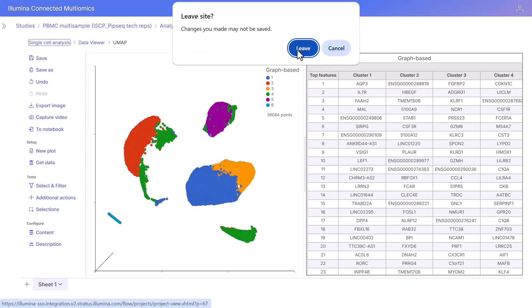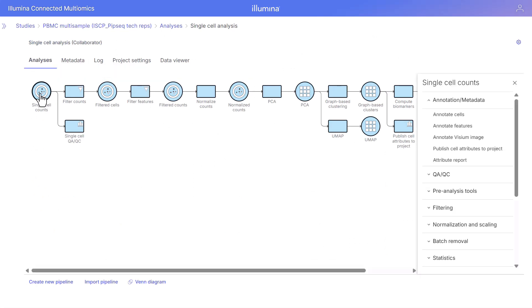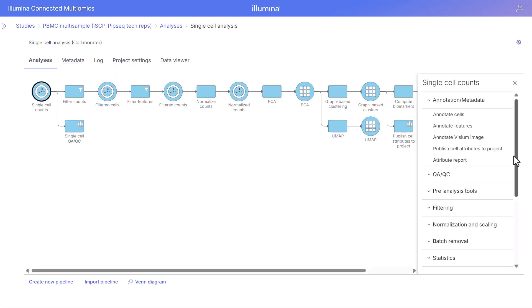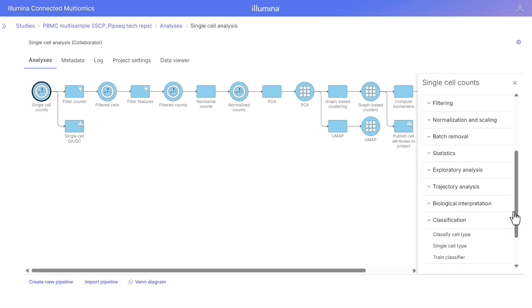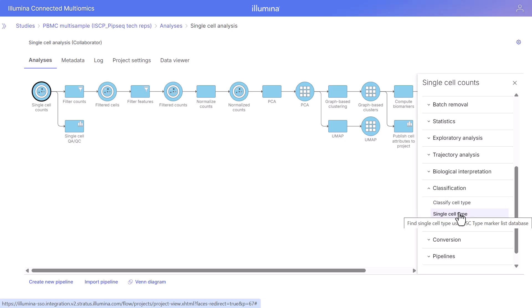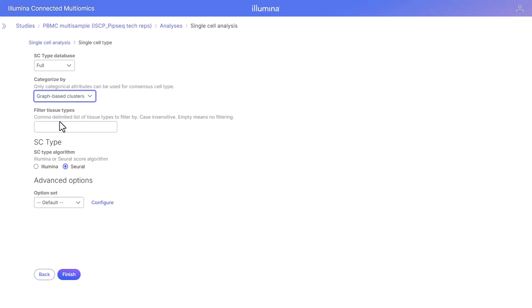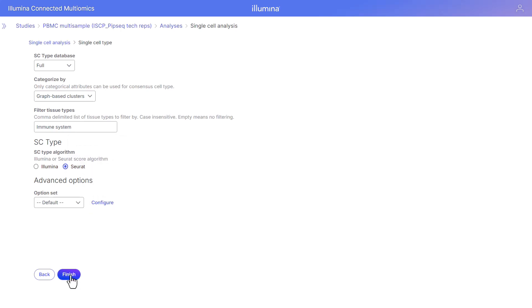Let's go back to the analysis tab. Next we are going to perform automatic classification. We click on our counts node and navigate to classification. Two options are available: Garnett automatic classifier or SCType automatic classifier — we're going to choose SCType. We'll use the full database and use the graph-based clusters as the attribute for our consensus cell type. Because we are working with PBMCs, we're going to filter this to the immune system, and click finish.